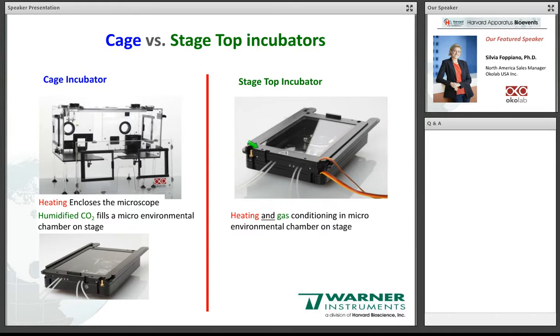For this reason, there are some wires. The lid and base are heated, and this lid is made of glass coated with a special coating. It's called ITO. It is optically transparent and electrically conductive. It will warm up and then irradiate the heat towards your sample.